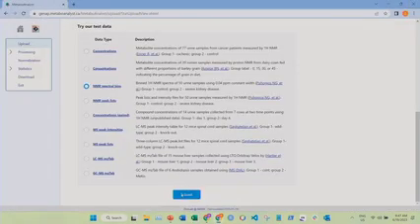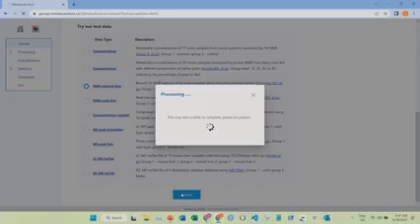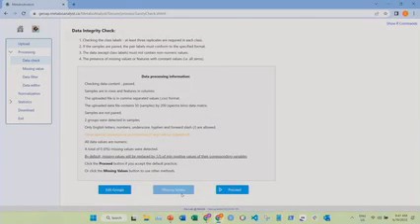All right. So I'm just going to submit this. There are no missing values in our data set, so this is grayed out. But if there are, you can click this and it'll show that interface that I showed earlier, where there's 10 or so different methods for imputing the missing values.